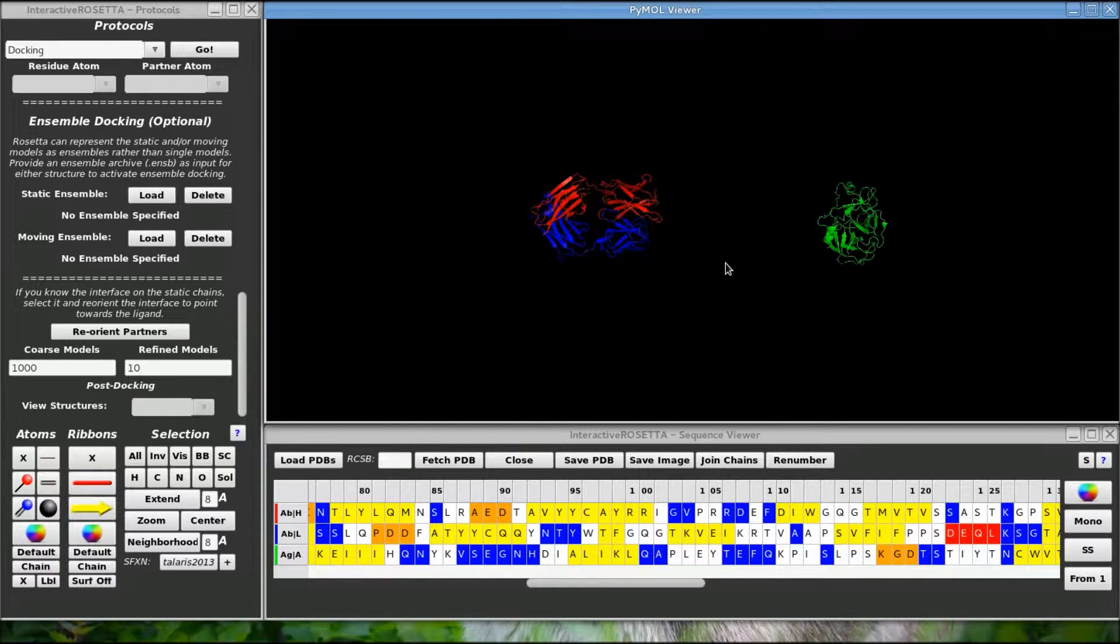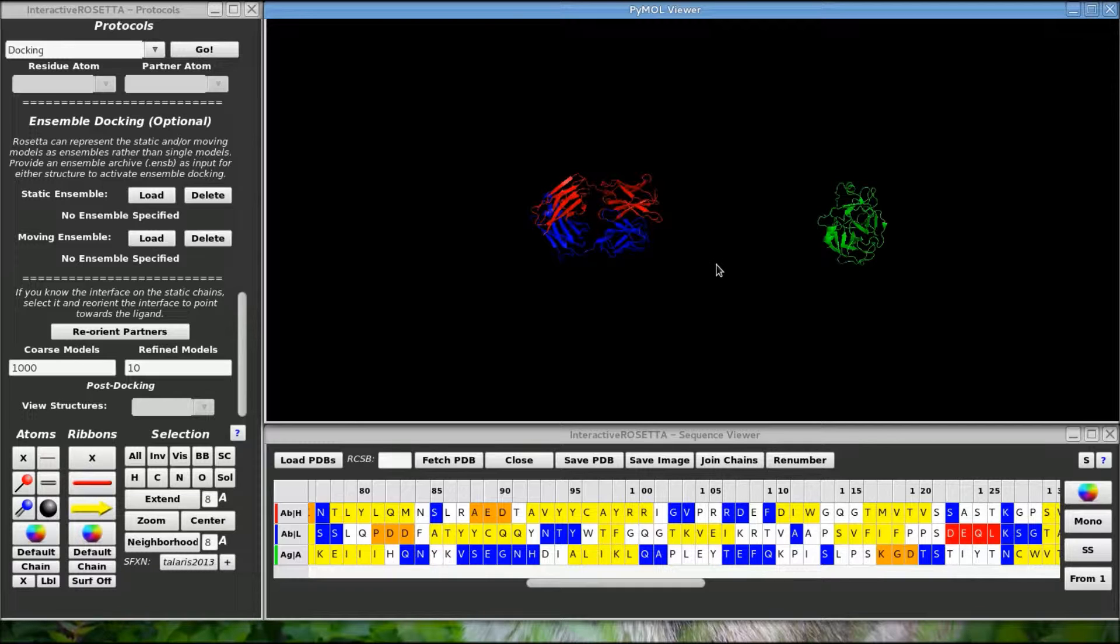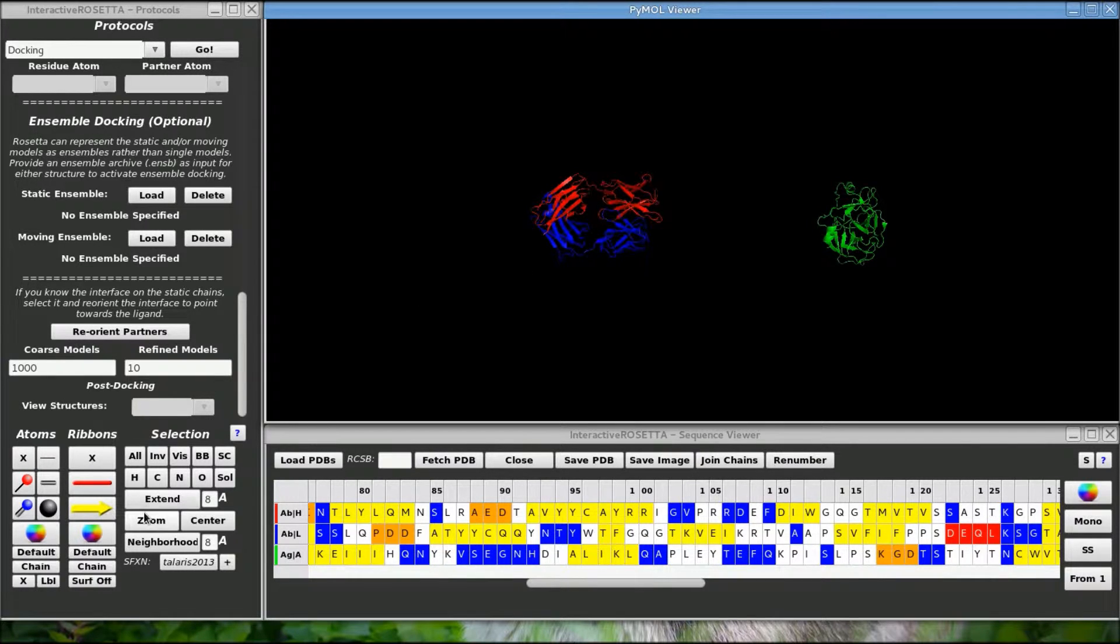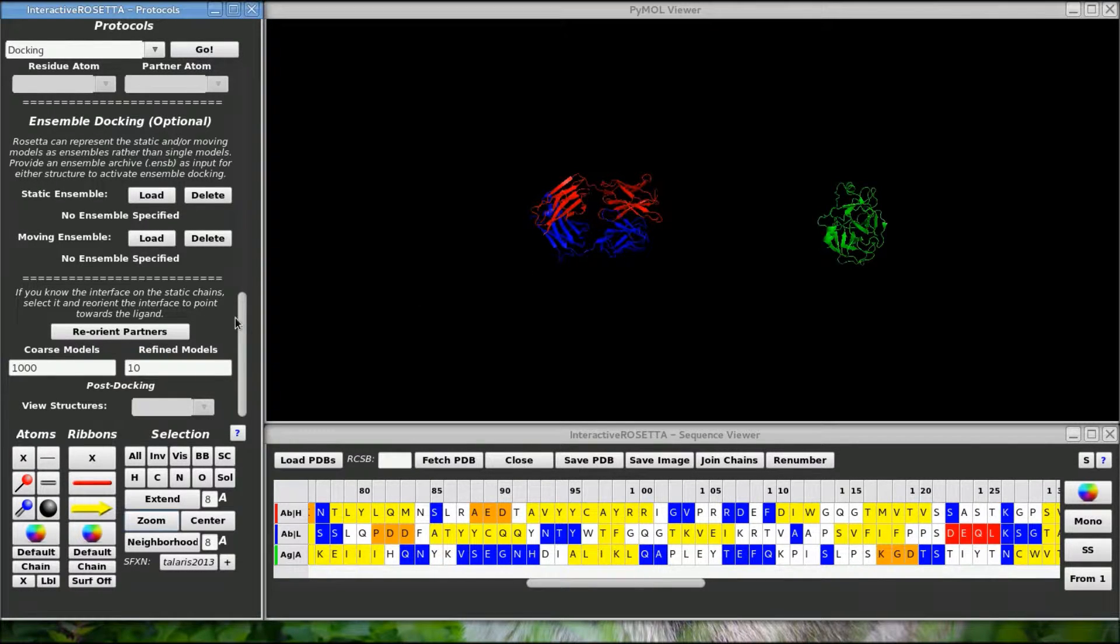So you may need to play with the interface selection or do some touching up with the manipulation panel after this. But this technique is useful for getting the structures oriented more properly, which will save Rosetta from doing all kinds of bad searches on the antibody.